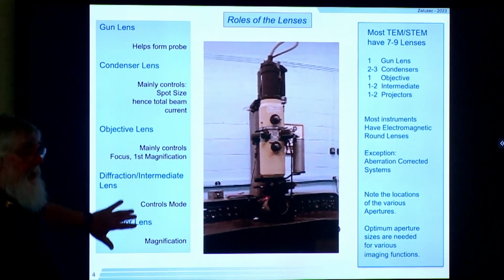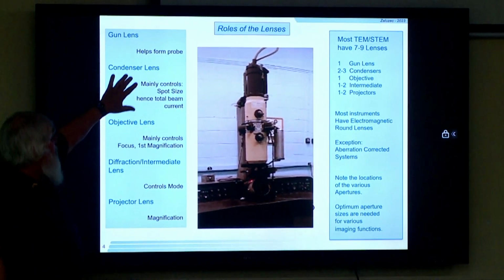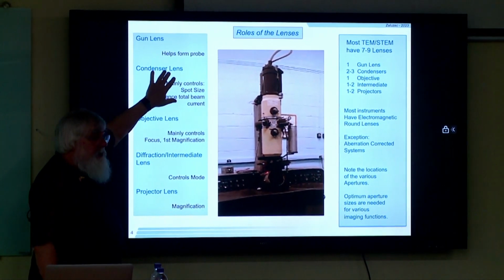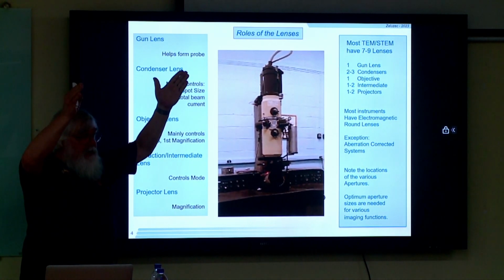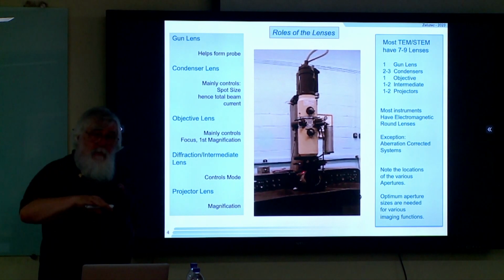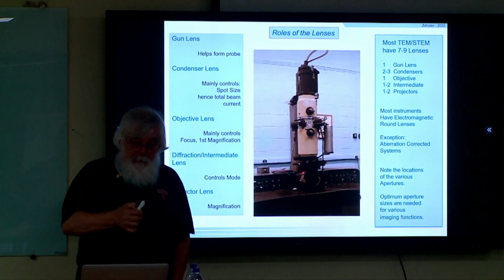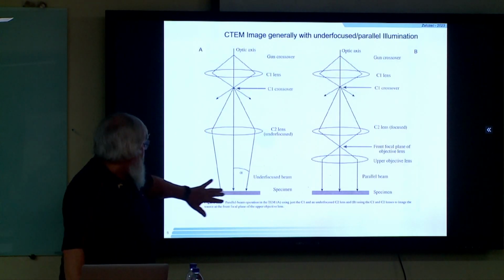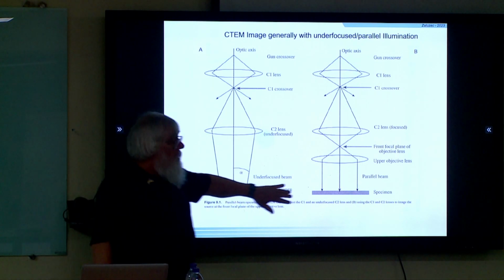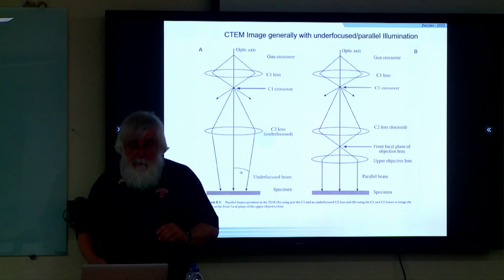We already talked about the microscope per se. We really don't do a lot of work in the illumination system now. We try to get in TEM imaging mainly a parallel beam. The objective lens is fixed, and contrast is now how we orient the sample relative to everything else. So we'll mainly be working with either an under-focused beam or a parallel beam for TEM imaging.